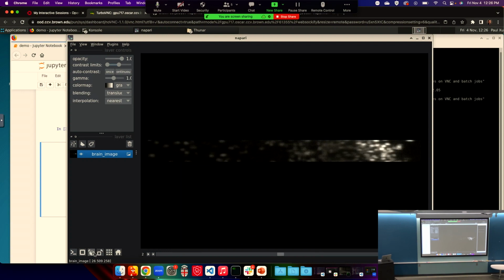Yeah, please. Maybe this is looking ahead a little bit. Mm-hmm. This is a Z-stack. Yeah. Typically, it comes with metadata, like, for example, how far the Z-planes are from each other. That would get lost in the generic NumPy array. So yeah.